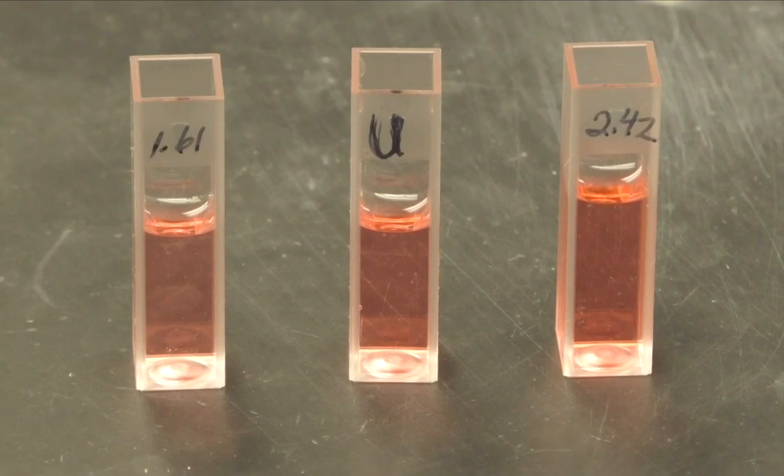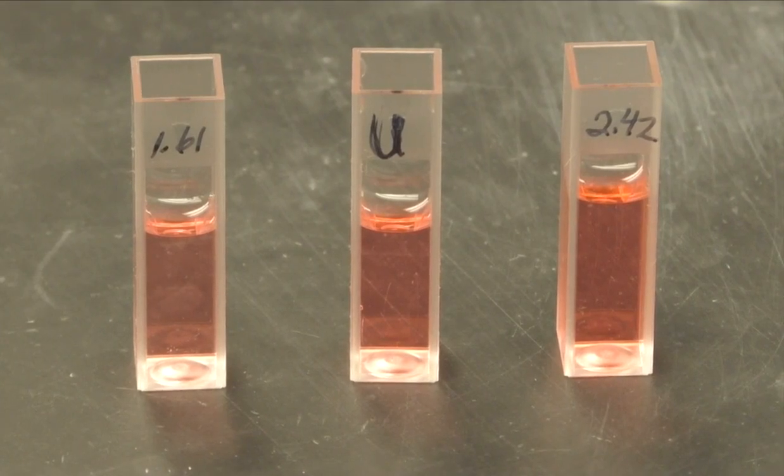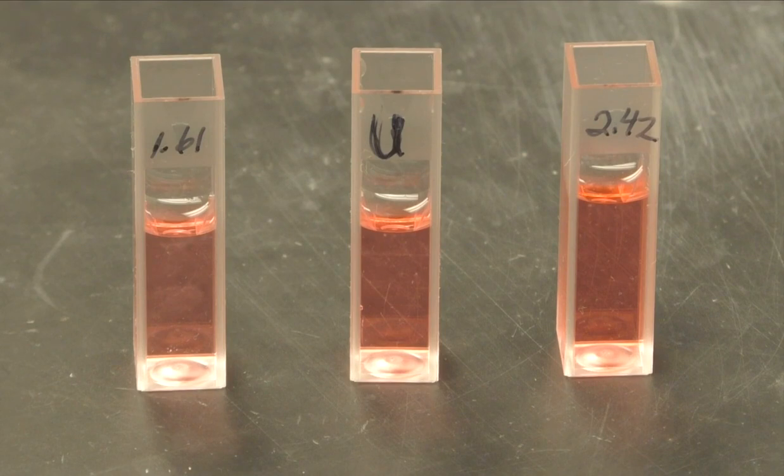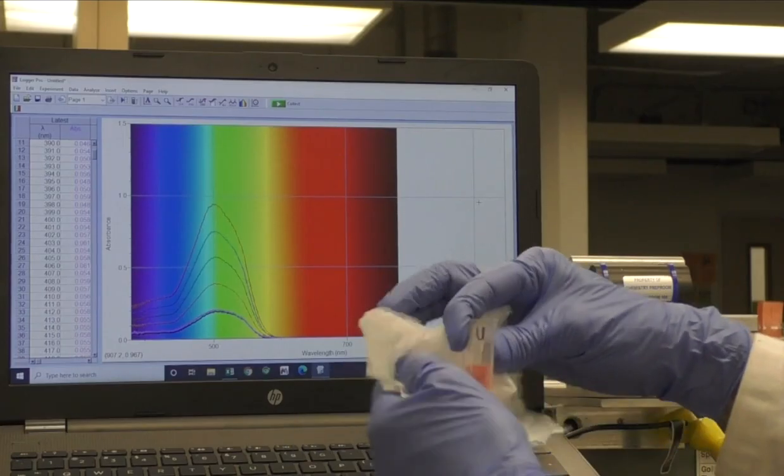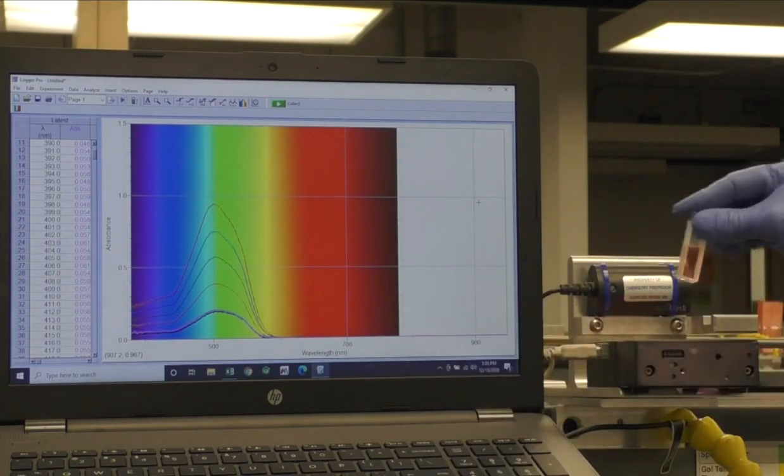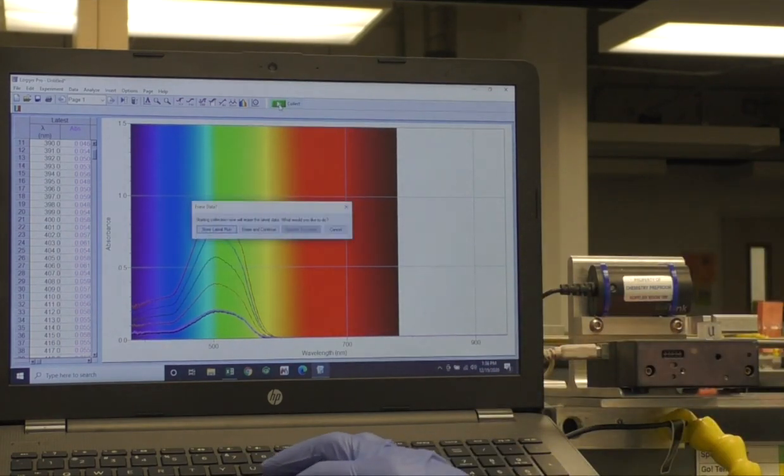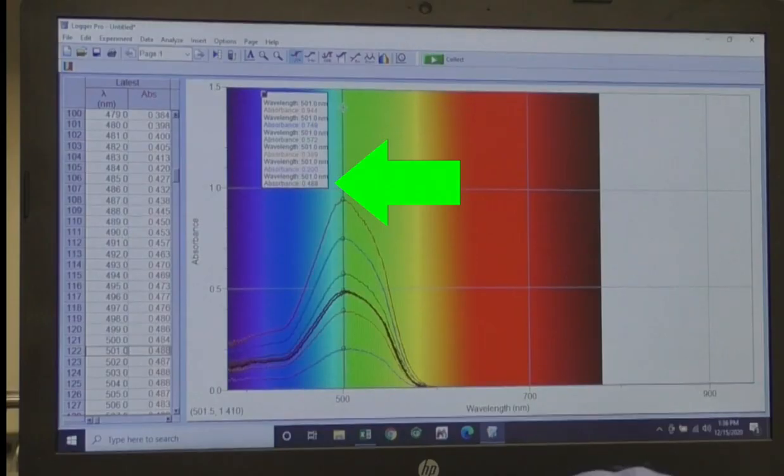If you have a solution of unknown concentration, take a reading of it at the same time as your known solutions. Here you can see our unknown looks like it is between our created dilutions with concentrations of 1.61 × 10⁻⁵ and 2.42 × 10⁻⁵. Knowing their absorbances are 0.389 and 0.572, let's see what our unknown is. It's 0.488, exactly what we expected.